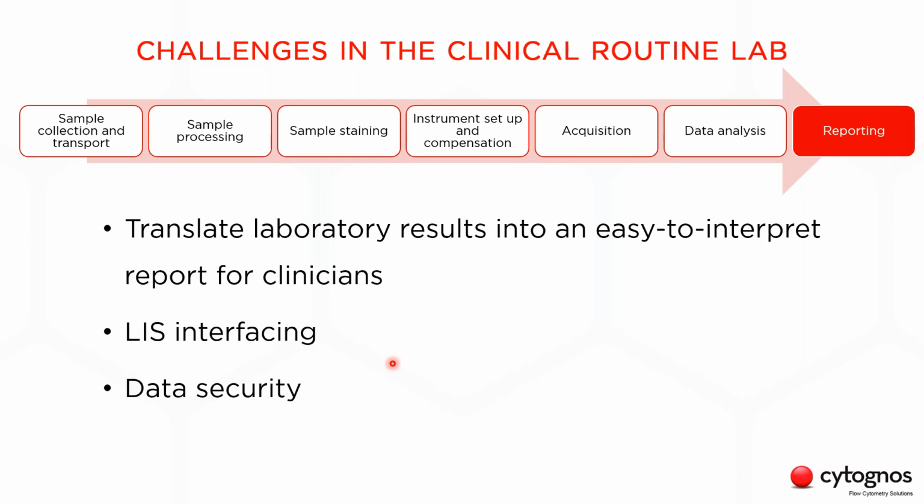Lastly, we have to put together a report with our lab test results, transfer it to the LIS system so it can be accessible to the pathologists and clinicians. And of course, ensuring that all the sensitive data is protected.